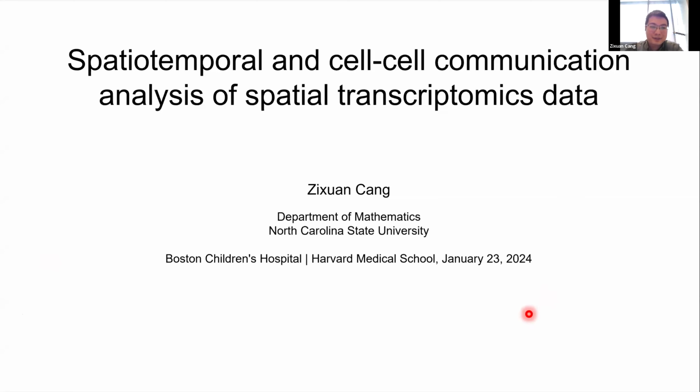Hello, everyone. Today I'm going to talk about a method that we worked on for analyzing cellular communication, given some spatial annotation of transcriptomics data. And alongside that, I'll also talk about some related methods we developed that mainly serve as auxiliary methods to assist the analysis of this cellular communication in spatial transcriptomics.